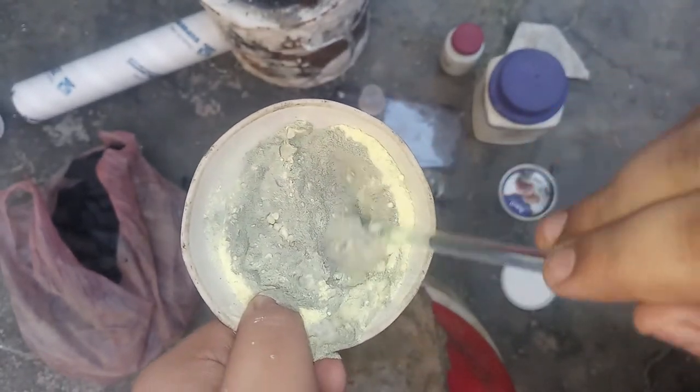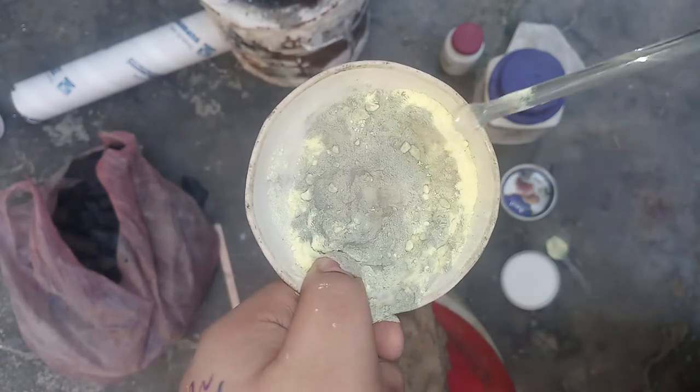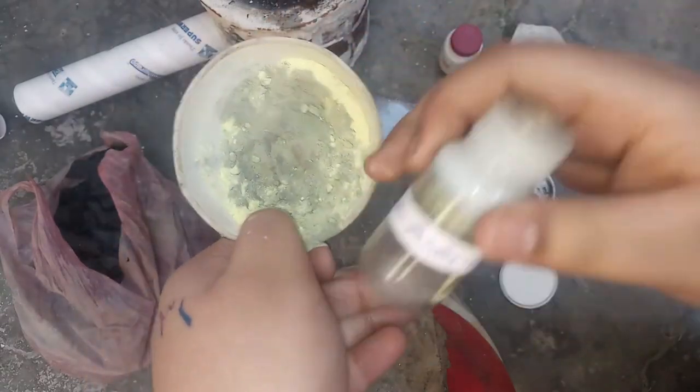We are going to use the UV lighter. Now add copper metal — 1.44 grams.